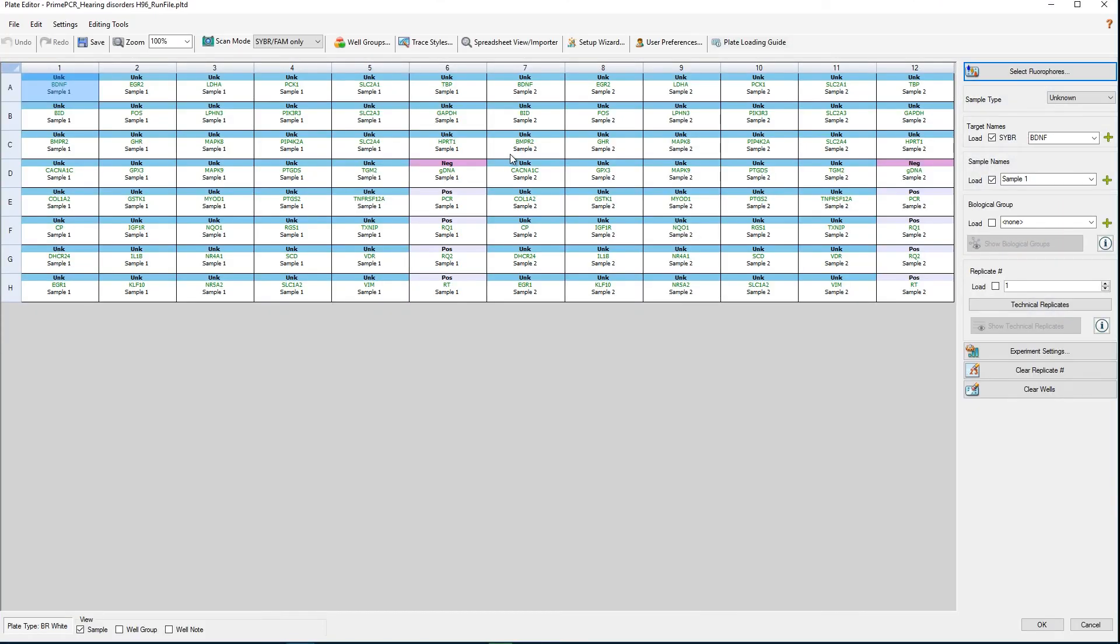All that's left to do is to add sampling. If you wanted to, you could start the real-time PCR run now.